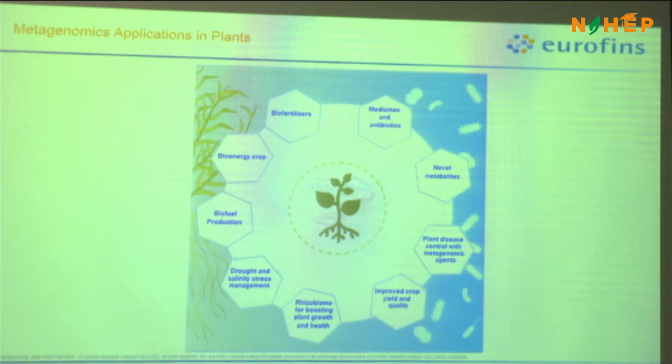We will remove the rice part from the entire metagenomic data, which will be somewhere around 80% to 90% of your entire data. Then only the 10% which is left behind will be taken for metagenomic analysis.